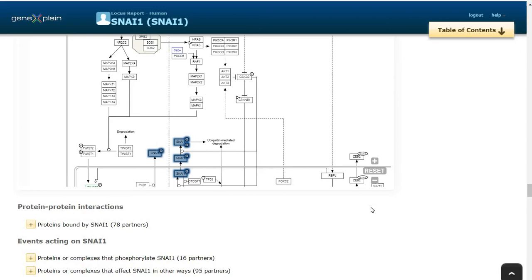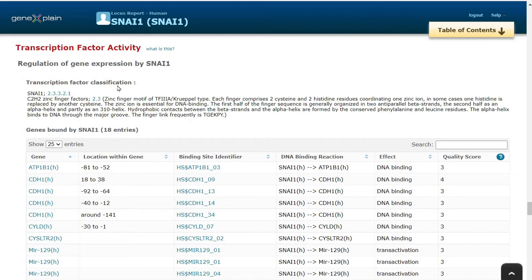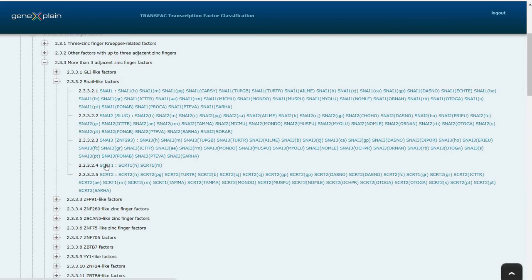Another key information is transcription factor activity of SNAI1. We can see here transcription factor classification for SNAI1. When we click on this, we can see the detailed information and the transcription factor classification for SNAI1 transcription factors. Here we can see that SNAI1 is located in C2H2 zinc finger families.